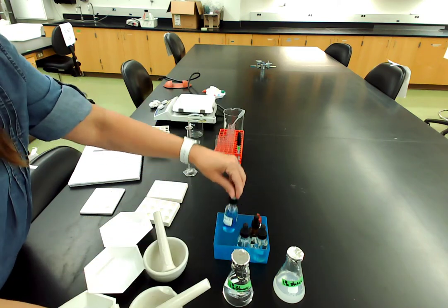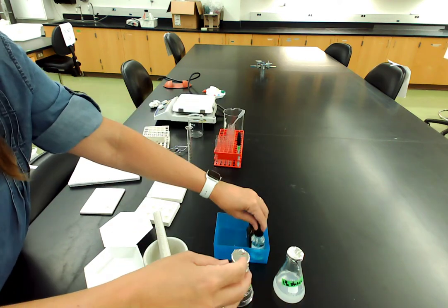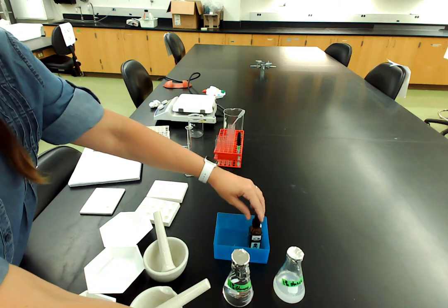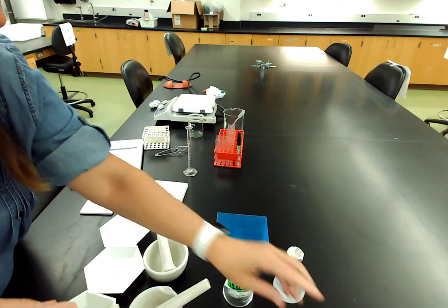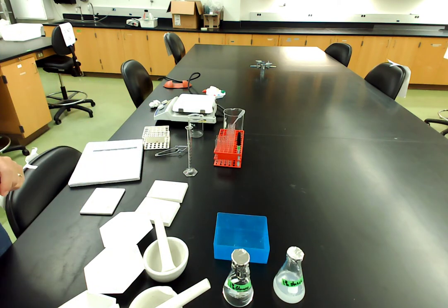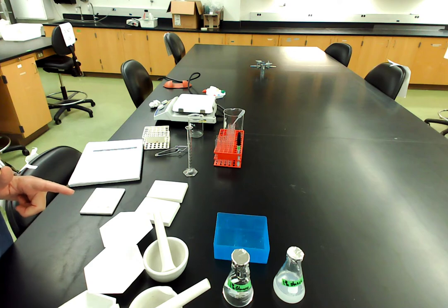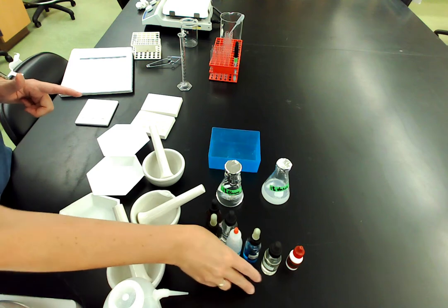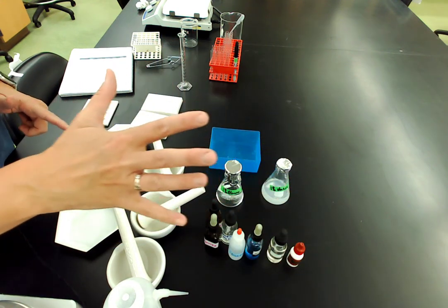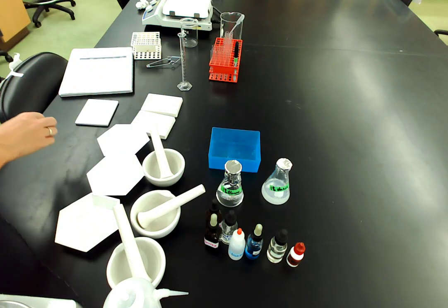Distilled water, Benedict's, more distilled water, mineral oil, this is iodine, and I want to say there's one other thing I think we have that I'm missing. There are all of our little bottles down here. So one of the things that I suggest doing is making a list of all the substances that we have here.